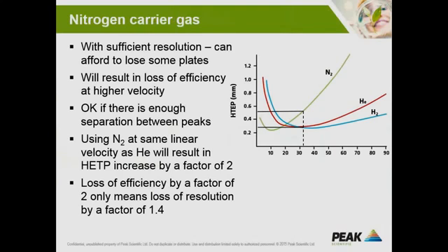Looking more closely at nitrogen as a carrier gas, I'm sure many of you in India are perhaps using nitrogen already, and so some of this won't necessarily be new information, but I'd just like to illustrate the virtues of nitrogen. With sufficient resolution, you can afford to lose some plates. So if you look at the Van Deemter curve on the right hand side of the screen, you see the HETP, which is the plate height, and you'll see how this varies as you increase the velocity of the carrier gas.